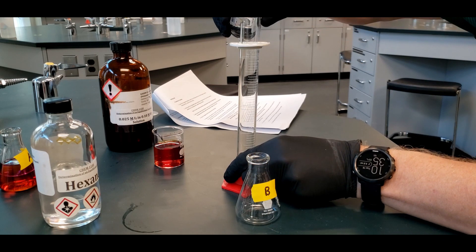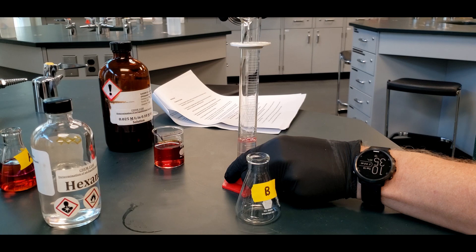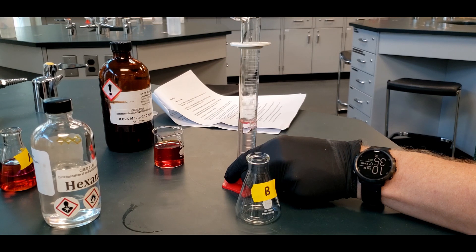The reason is we want to show that the equilibrium constant is independent of our starting amounts. We just need to know what it is at equilibrium.